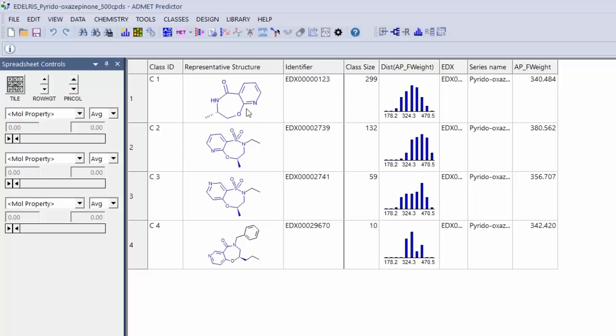You'll notice that this scaffold here in blue is a regioisomer of the one on top. What is kind of murkying the waters a little bit here is that they're not oriented all the same way. So what I'm going to do is bring them up and show you how you can align these correctly so that it just becomes a lot easier to look at them.